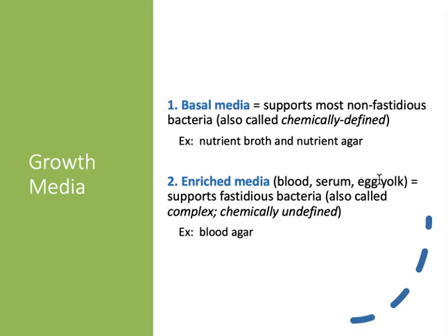Enriched media, in other words, contain a complex ingredient that is very nutritionally dense. Blood, for example, contains many different individual molecules, proteins and fats and carbohydrates, that just might meet those very special nutritional requirements that fastidious bacteria have.